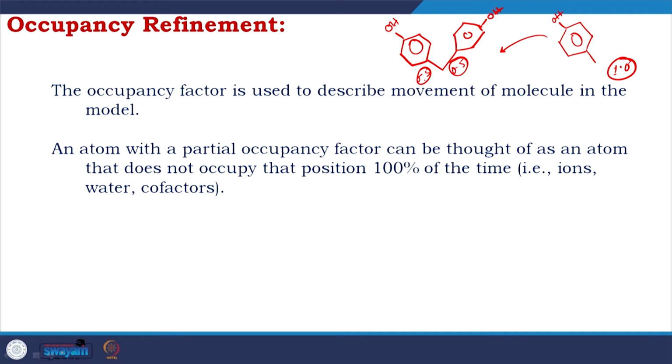Also, here I have to tell you a very interesting concept. The software has acceptance limits, so it would consider a conformer only up to a certain level of intensity.